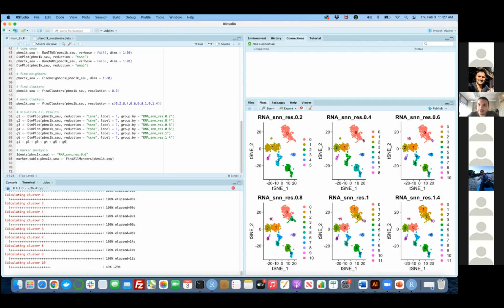As I've been describing this to you, the analysis is nearly done. We had 11 clusters, and for each cluster, we analyzed each gene and calculated log-fold changes and adjusted p-values to see if that log-fold change is high and significant, to understand the markers.